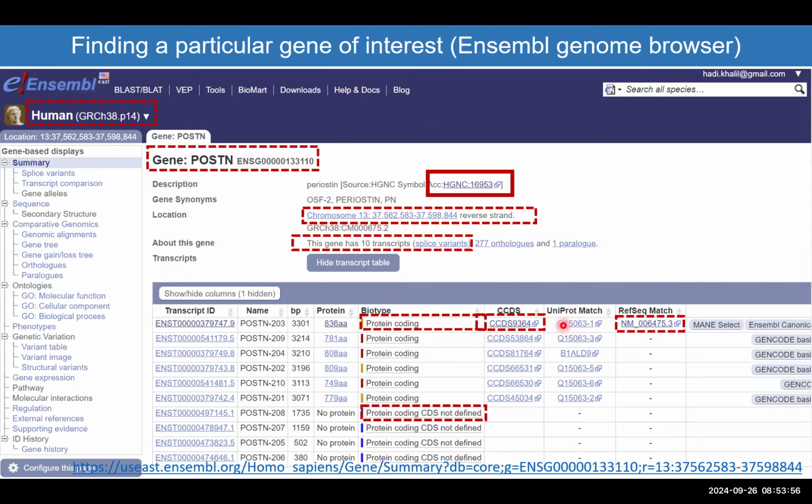And there are matches between these proteins. So there's another database for proteins. It's called UniProt, if you haven't used this before, in the Swiss Bioinformatics Institute. We are not going to go to these details. Today, we are just discussing the coding sequences. And then we have the RefSeq sequence that you can find in NCBI, where you can get the messenger RNA. So you can click to this, and it will take you directly to NCBI.